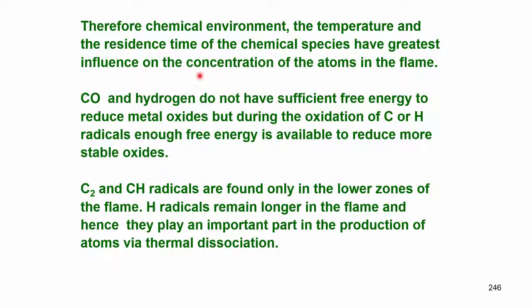Okay. So, the chemical environment, the temperature and residence time of the chemical species have the greatest influence on the concentration of the atoms in the flame.